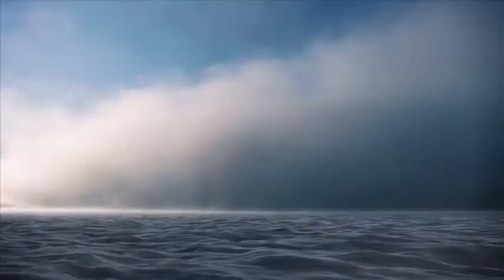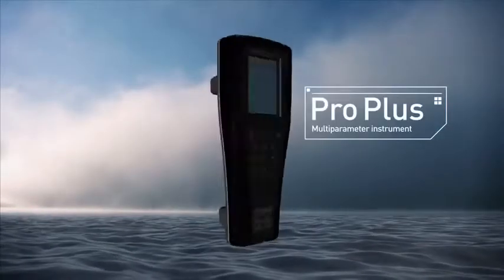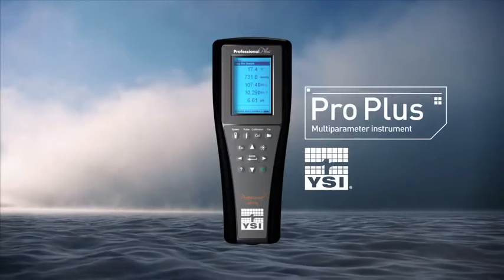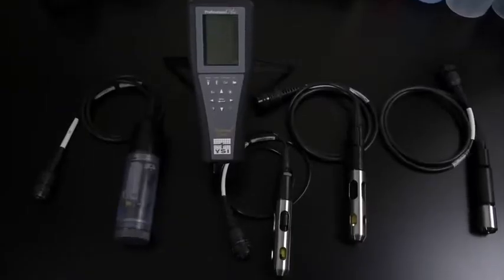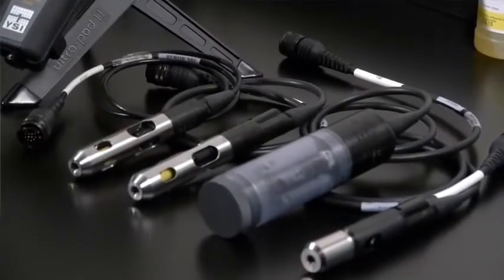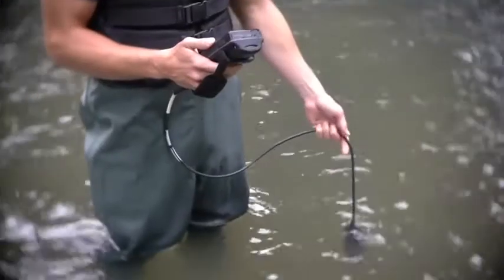Tough and smart in the lab or field, the Professional Plus or Pro Plus is extremely versatile. It even works with any combination of YSI Pro Series cables, sensors, and accessories. The YSI Pro Plus is the ultimate handheld sampling instrument.